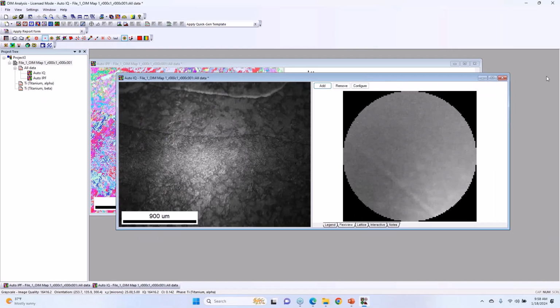How do you run the Montage imaging, like field of view? I told you we get the best data at about 500 microns. I usually run at about 500x. Or do you run a little bigger and try to have a little more overlap to stitch later on? No, I'll still run at about 500x and use as many tiles as it takes, and I usually just use the 10% overlap.